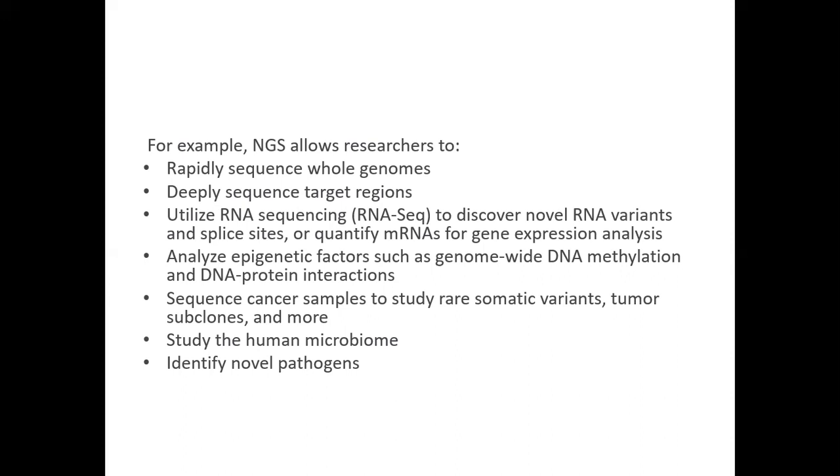And we can also analyze epigenetic factors such as genome-wide DNA methylation and DNA-protein interaction. We can do that too with NGS. It's also possible to sequence cancer samples to study rare somatic variants, tumor subclones and more.